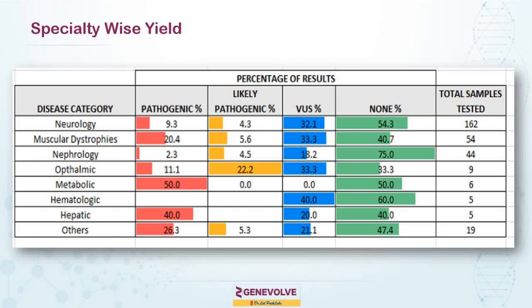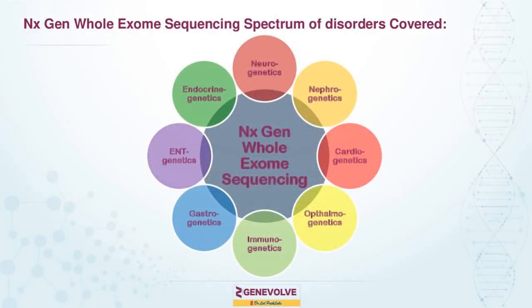The yield can definitely be increased when you are looking at trio cases, because what you have in trio cases is that you have the data available for the father, mother, and the proband. So this is very important: the more we test, the more family members are tested, the yield is likely to definitely go up. So what we find is that the whole exome sequencing spectrum covers a wide variety of disorders, and it has been finding space in all the various streams of science.